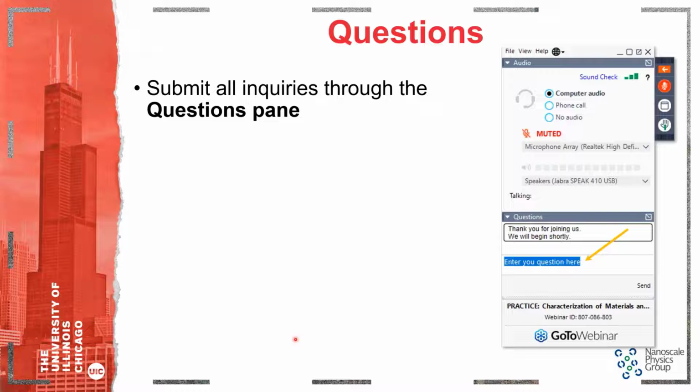Another question was regarding the liquid thickness of the liquid cell experiments shown at the end with the indium phosphide quantum dots. Are you able to characterize the thickness of the liquid in the graphene cells? That's a good question. We can estimate that the liquid cell thickness is on the order of tens of nanometers.